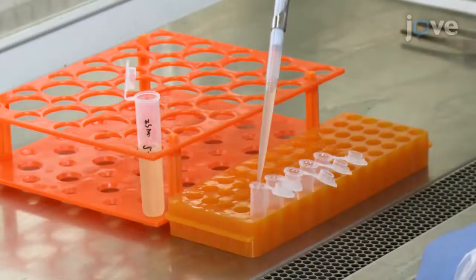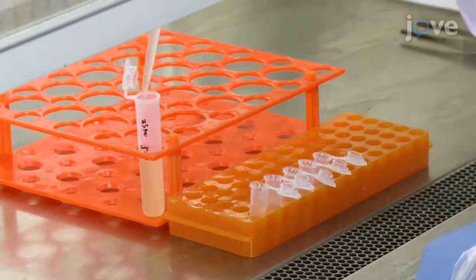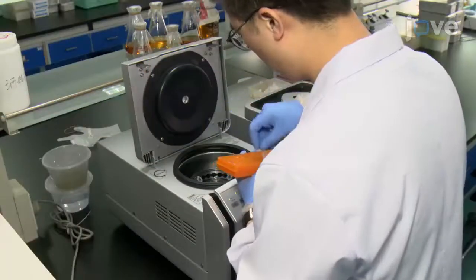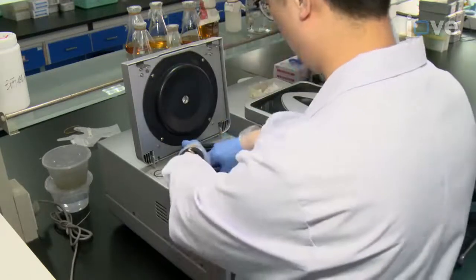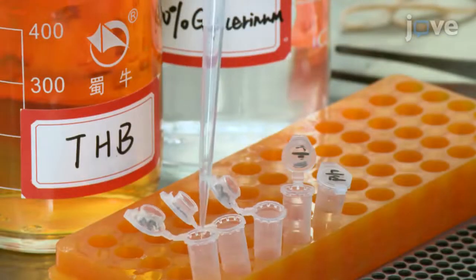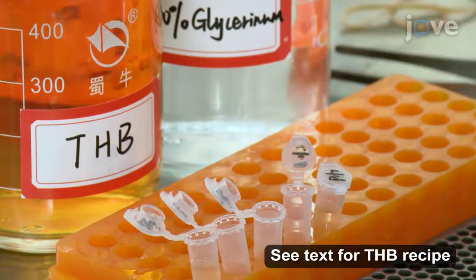To collect strain P17 planktonic cells, first collect 5 mL of the cells from mid-log phase culture. Centrifuge for 3 minutes at 8,000 times G before washing the cells 3 times in PBS. Resuspend the cells with 5 mL of 25% glycerol in THB and aliquot into 5 tubes.